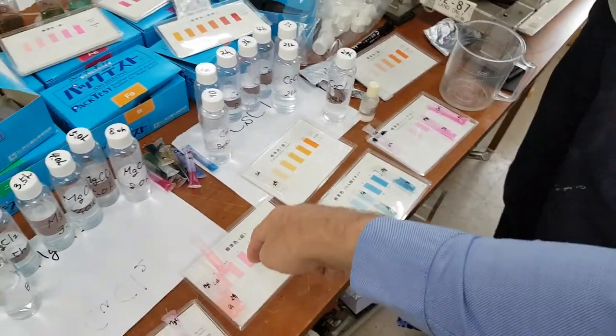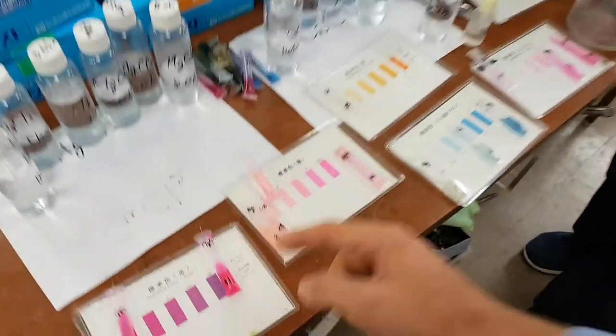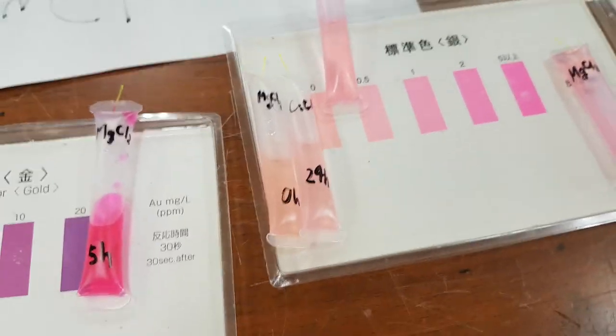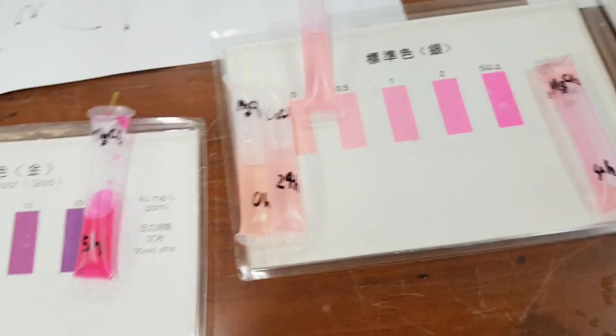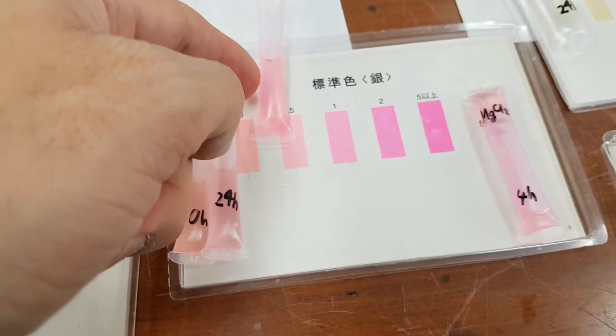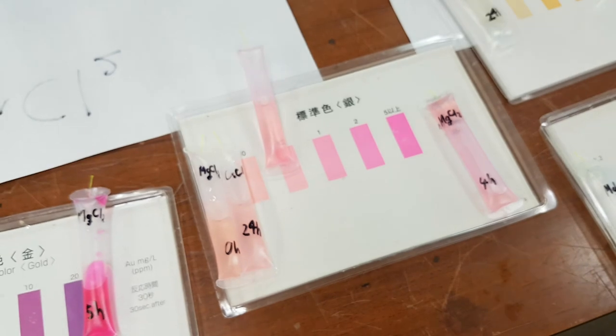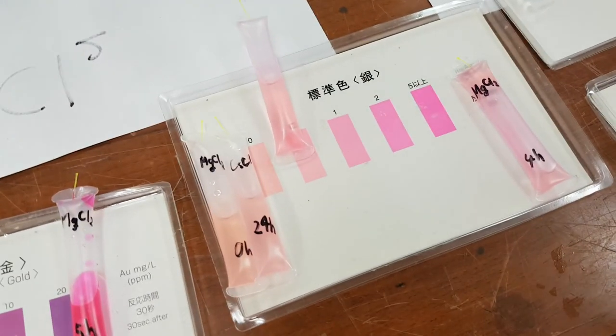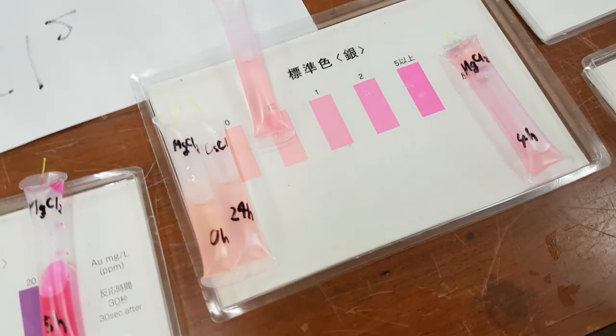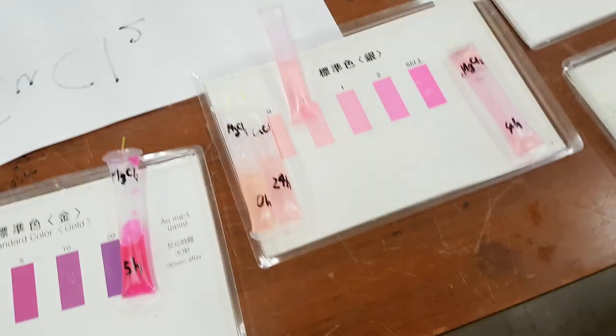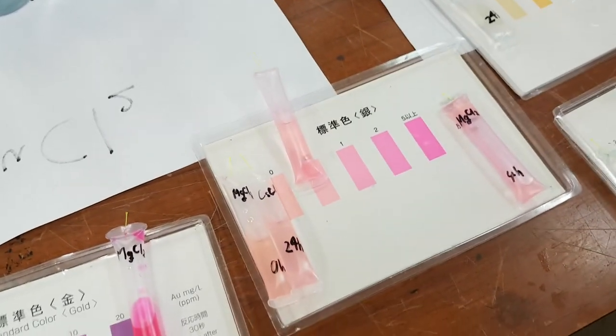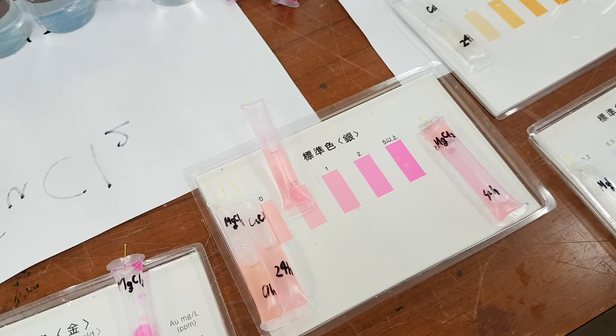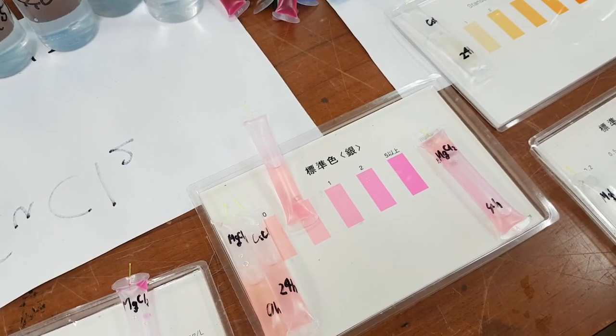But this is a result that is seen in LENR experiments. And if you're seeing it here, which it would appear that, certainly to my eye, it looks like you have silver. And this is a kind of expected result you would see in LENR. So I think this is approaching a positive.